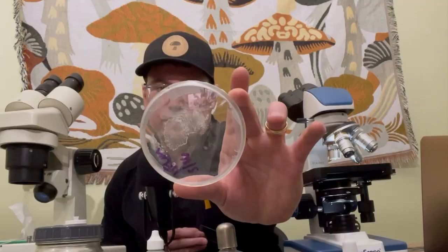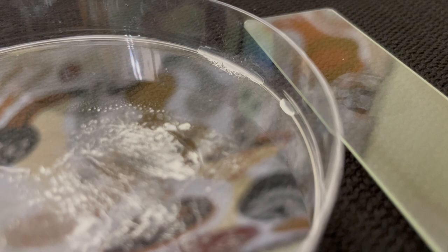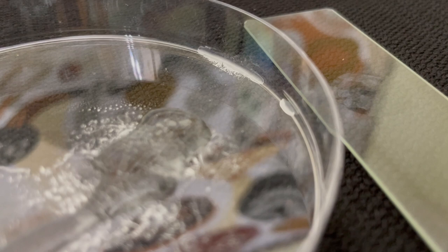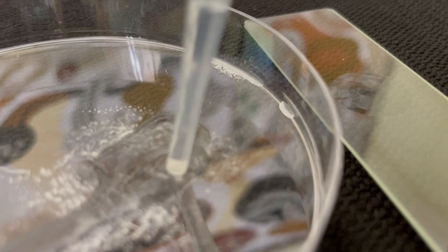For the first slide, I'm going to prepare a wet slide with this lion's mane spore print. I've got my sterile water here that I'm just going to place on top of these spores to loosen them up off the surface. Then I've got my plastic pipetter here, and I'm just going to try to peel some of these spores right off the surface of the spore print and place this right in the center of that concave.